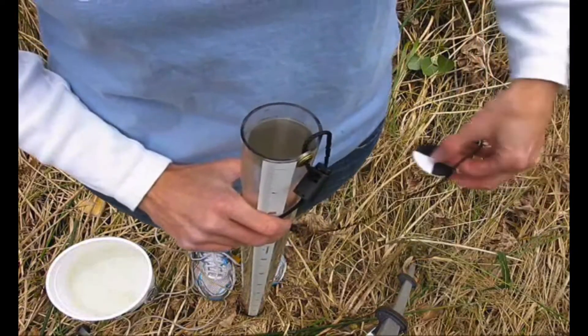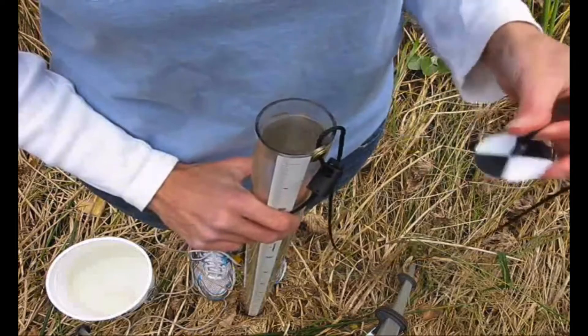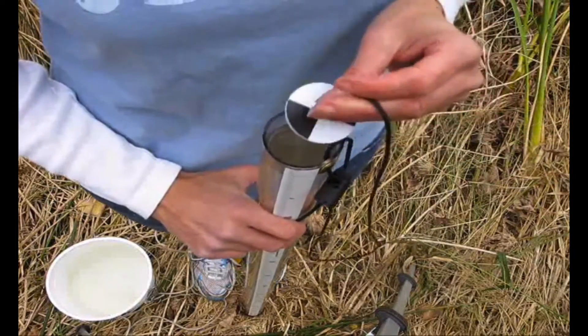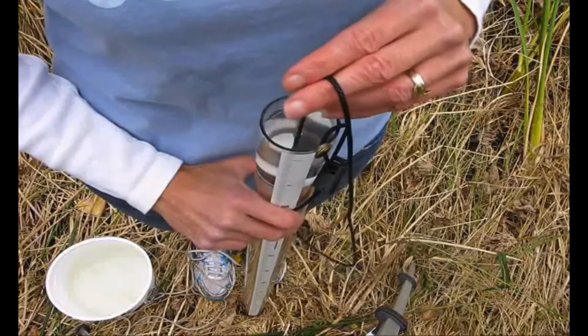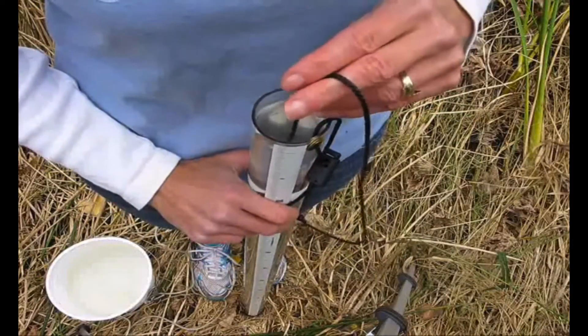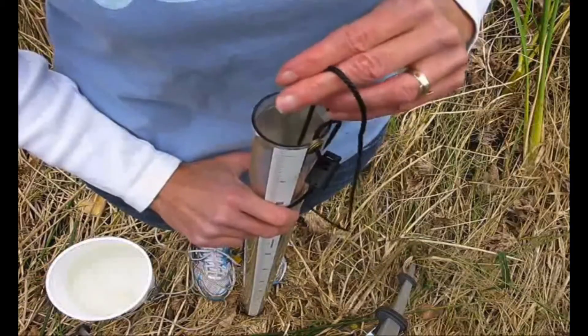Once your tube is filled with your water sample, take the disc and lower it from the top into the tube. While looking down into the tube, lower it until the disc disappears.